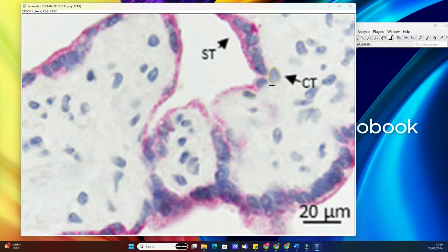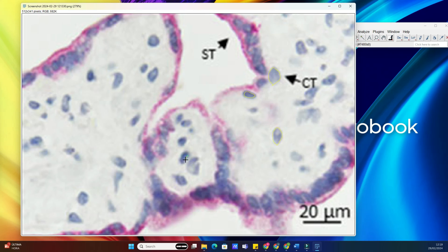Go to the toolbar and select the Polygon Selection tool, or press the P key on your keyboard. With this tool, we can draw custom shapes around each cell. Simply click to create points and close the shape by clicking on the first point.